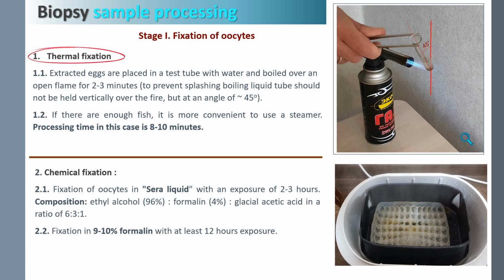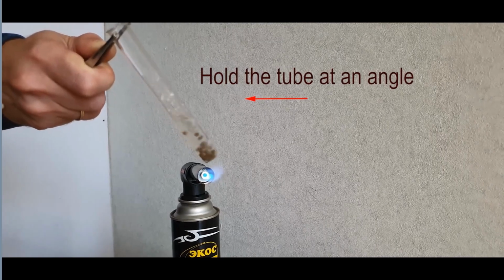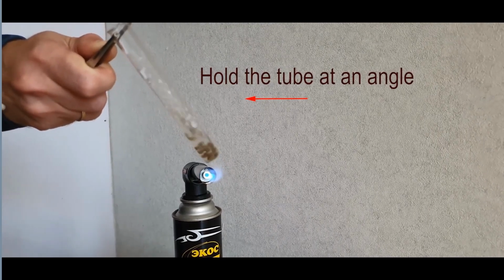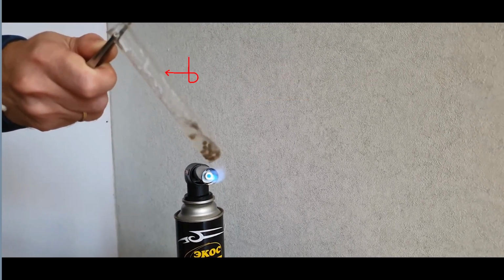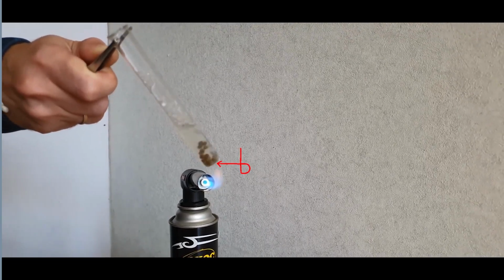If you don't have test tubes or a burner, you can use an ordinary spoon and an electric stove for cooking. If you use a steamer, you can use containers for freezing ice with small cells to place the eggs in it. This is how to cook eggs from one female in a test tube. Remember to keep the tube at an angle so the liquid does not splash out, and slightly above the torch burner, so as not to overheat the glass.